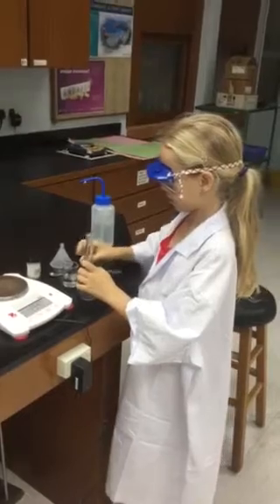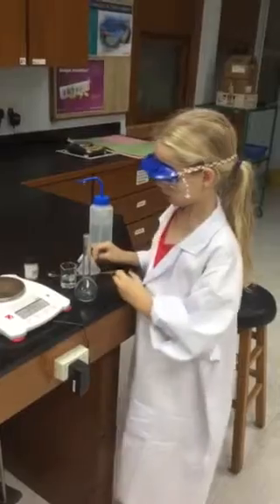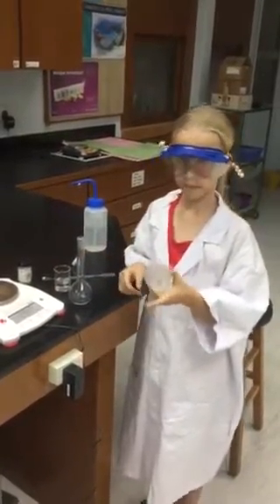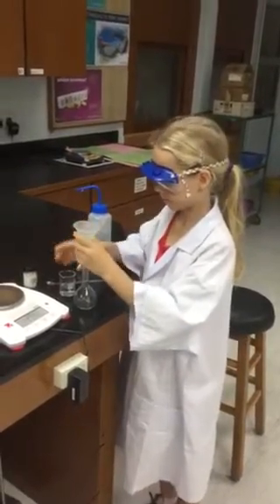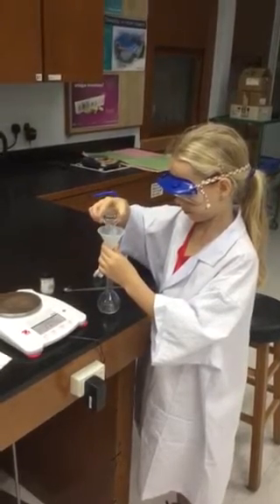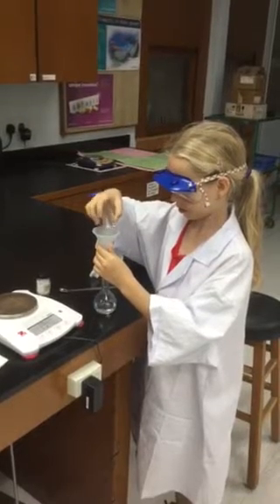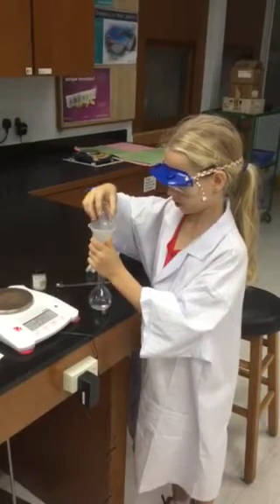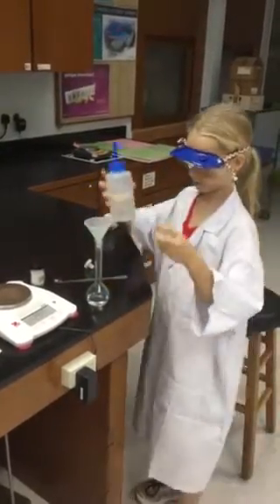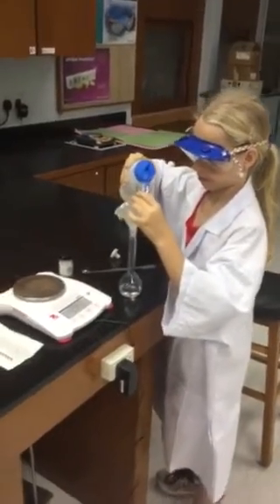The volumetric flask is a very precise piece of glassware. We're going to transfer our solution into there using a funnel. Okay, Nina? And we have to remember that our beaker and our glass stirring rod and our funnel have some of our solution. So Nina, can you take the wash bottle and use it to wash some of the solution from the beaker into the funnel and into the flask?